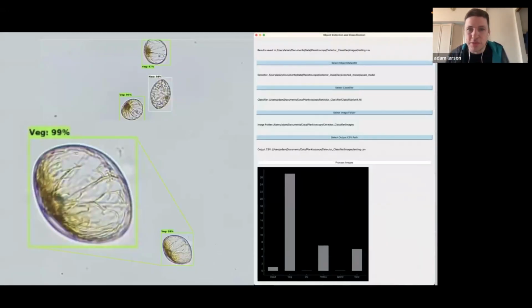And over a few hours, using these beautiful open source object detectors and TensorFlow, I was able to take those segmented images and then go back to the raw plankton images. And then in my culture, I'm now able to make these very good classifiers and detectors. And over time, with very high confidence, say exactly where my culture is in the different life cycles. And for this, I was able to see a lot of very cool things on the diurnal capabilities of this organism and how it actually lives in the ocean. And so again, these are all things you can do in a few hours, right? You can make these very high quality object classifiers and detectors, whatever you're looking for.